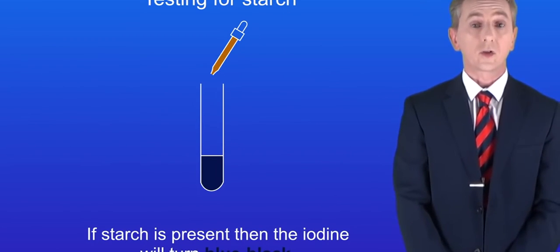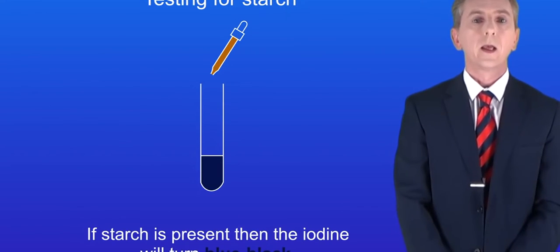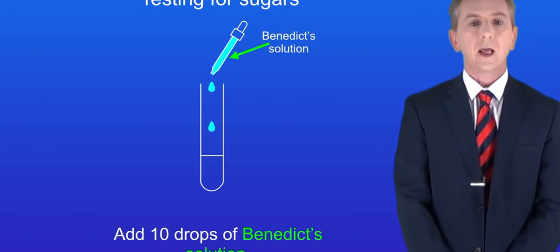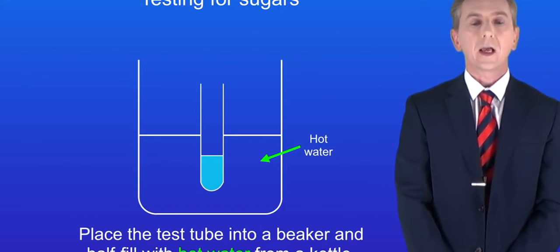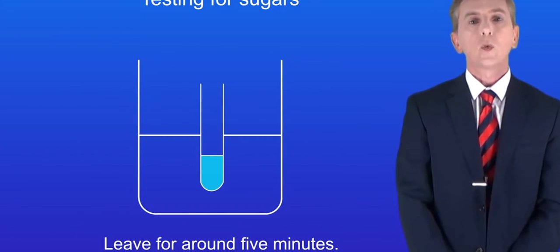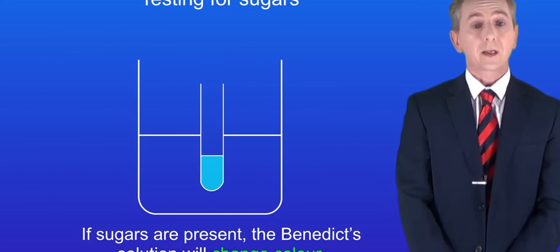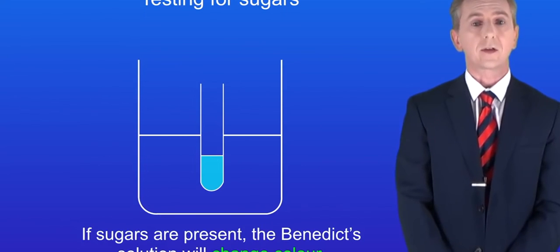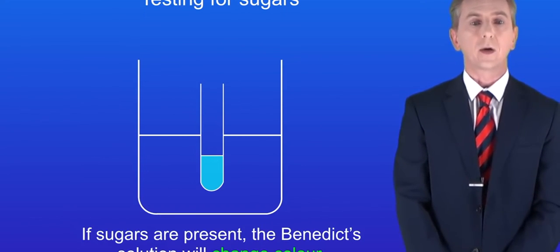Now, testing for sugar such as glucose is a bit more tricky. Again, we start with 2 centimeters cubed of our food solution. We then add 10 drops of Benedict solution, which is a blue colour. We place the test tube containing our solutions into a beaker, and we half fill the beaker with hot water from a kettle. We now leave this for around 5 minutes. If sugars are present, then the Benedict solution will change colour. The colour of the Benedict solution gives us a very rough idea of the amount of sugar present, but it cannot tell us the exact amount.